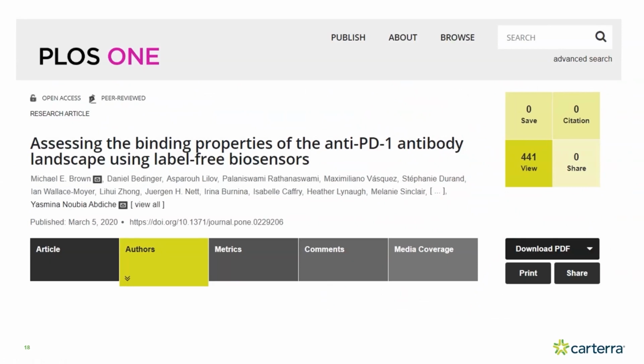And so it's a great review. It's a great demonstration of how we measure kinetics on the LSA and how that compares to the Biacore. Essentially, you get the same answer on the equivalent chip type. But it also goes into some interesting details about transport dynamics using different chip chemistries. So I highly recommend this read, and we thank our collaborators for this good work.